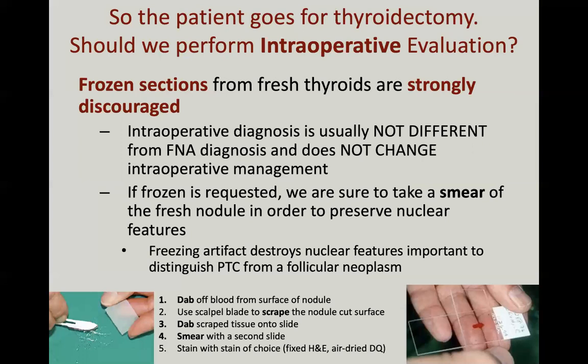And now you've effectively preserved the remainder of the periphery of that tissue, because once you cut into it, it retracts. That tissue plane around the thyroid gland, the non-capsule, just retracts like crazy. So in order to minimize retraction, make as few cuts as possible, and usually that's one longitudinal cut. Hopefully that answers your question. So both for salivary and for thyroid, that's what I would potentially recommend.